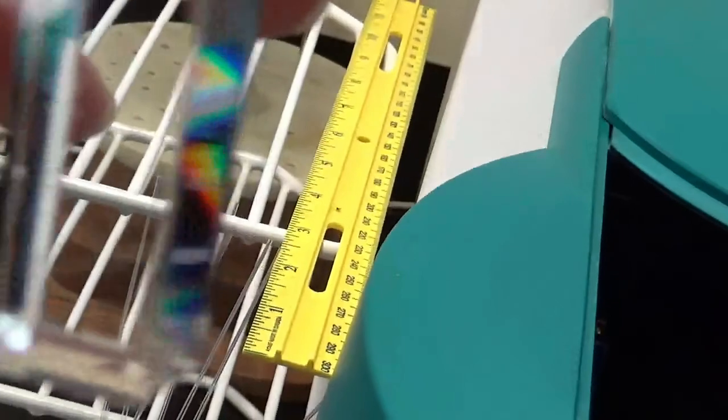All right, I've got solution 6 now. You'll notice there's some bubbles on top. I don't see too much bubbling within this sample, but there have been samples that have had some bubbles, and that could account for some of the fluctuation in the readings.